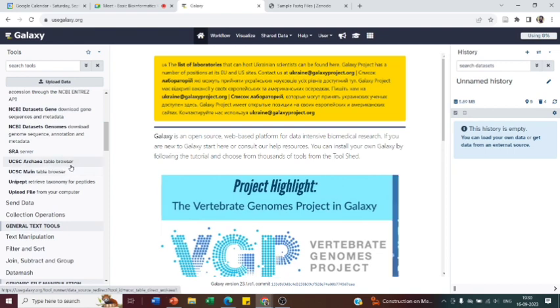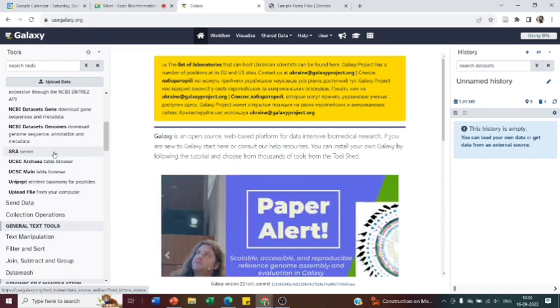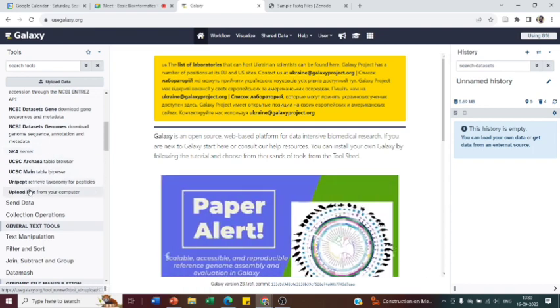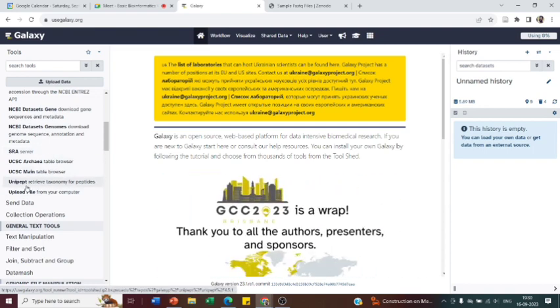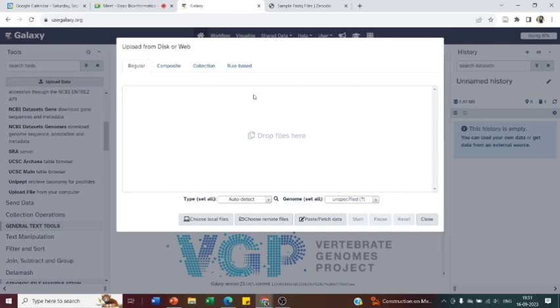You can also export from the UCSC browser. But I am going to upload from my computer. I have just downloaded from Zenodo. I am going to upload a small file from the computer. Upload file. I am going to upload that.